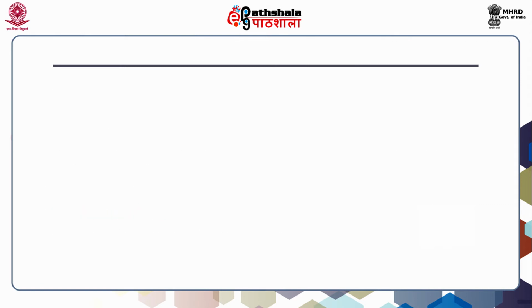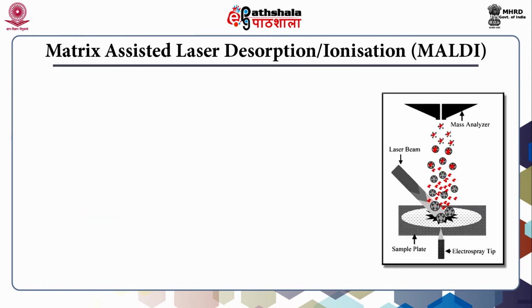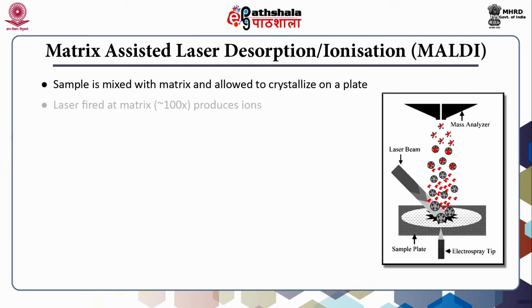Let us come to matrix assisted laser desorption ionization, otherwise called MALDI. When we are talking of samples, this is a protein, but the protein has to be digested into peptides, and the sample is mixed with the matrix and allowed to crystallize on a MALDI plate. The laser is fired at the matrix, which produces the ions.